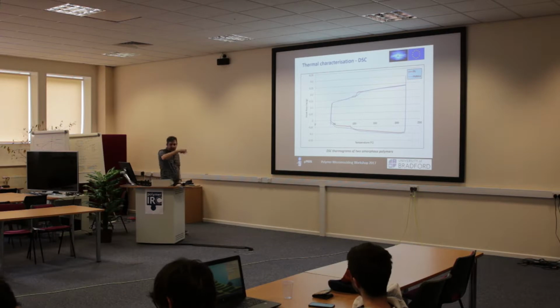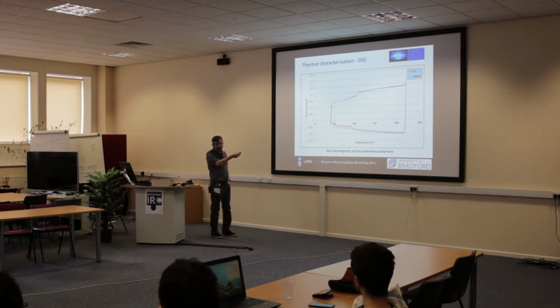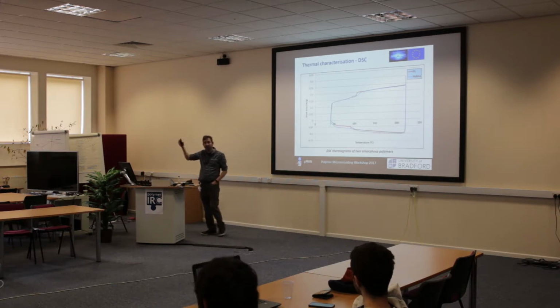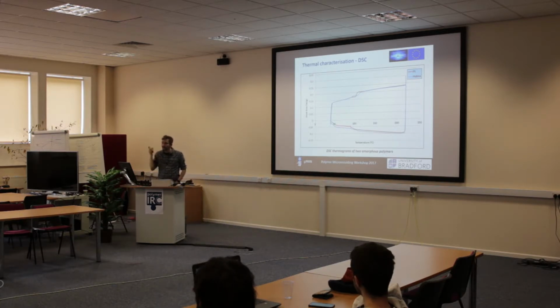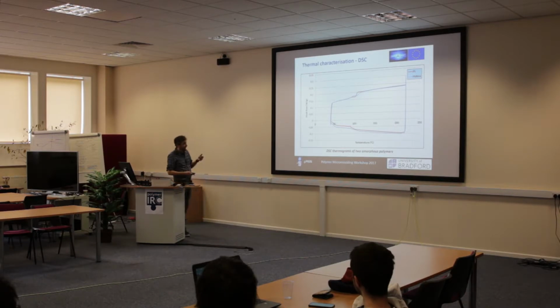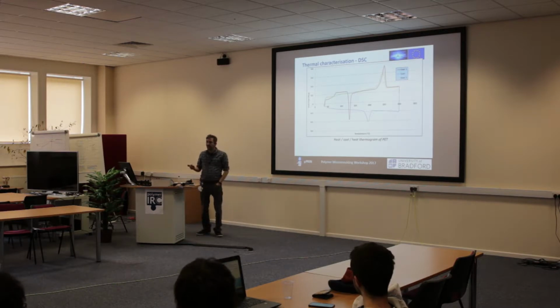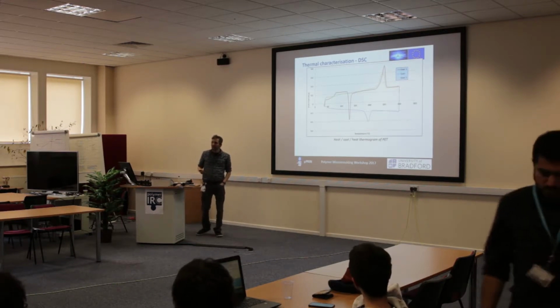But anyway, this glass transition always looks like a sigmoid, basically. I'd say the blue one's a bit difficult, but if you look at the red one, then you've got a sigmoidal S-shaped curve, okay? And that's what the glass transition always appears as. Sometimes it's very small, and you need to really zoom in in order to find it on your graph. Anyway, okay, that's what the amorphous ones look like. Is that complicated enough? Should we make it more complicated?